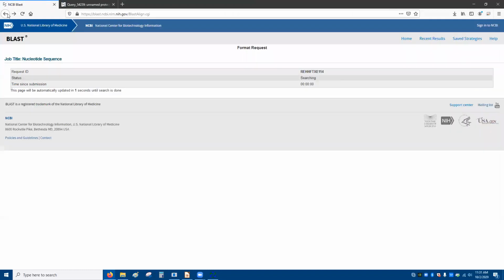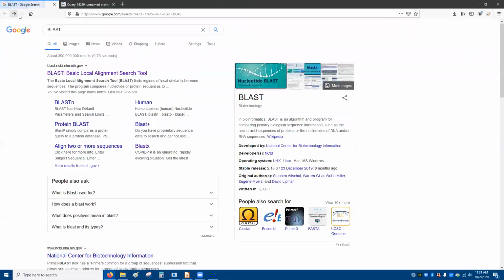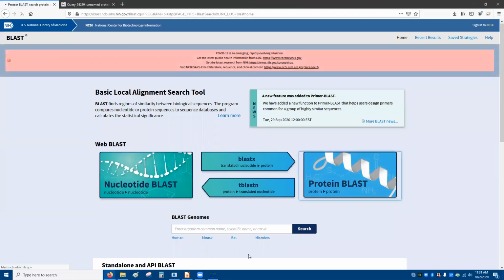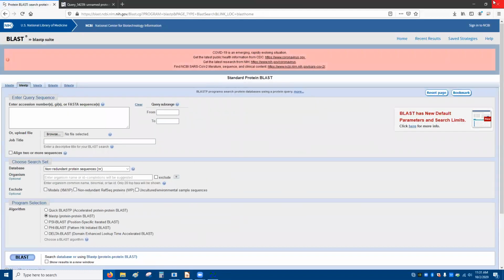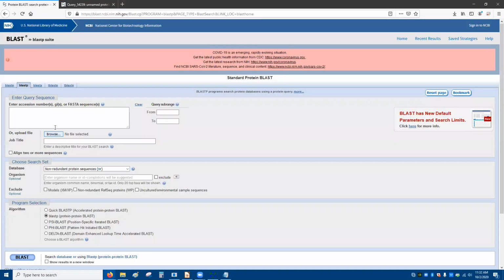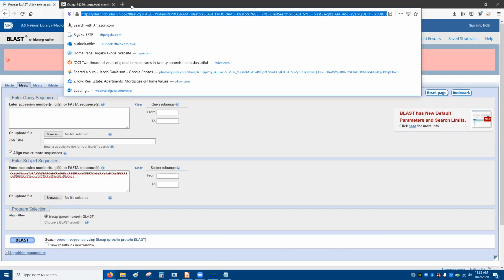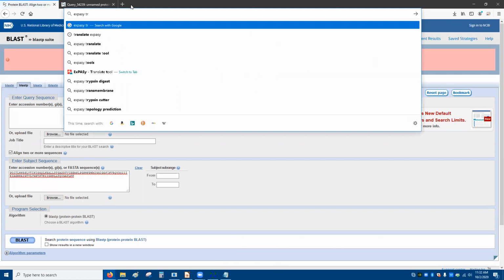Then we're going to do a protein alignment. I'm going to be happier with that. Oops, one too many. Protein blast. So I do need that thing I just closed. Again, downloads. Okay, so I want to align 2 more sequences. And we want this to be the subject because you just remember to keep them in order because you will have issues if you don't. And then we're going to use the ExPASy translate tool.